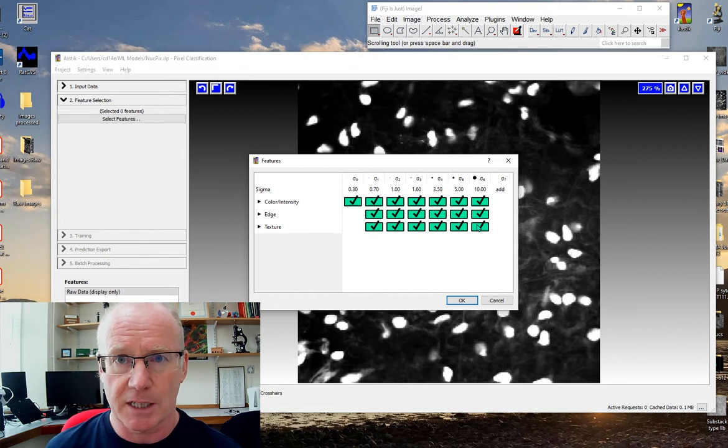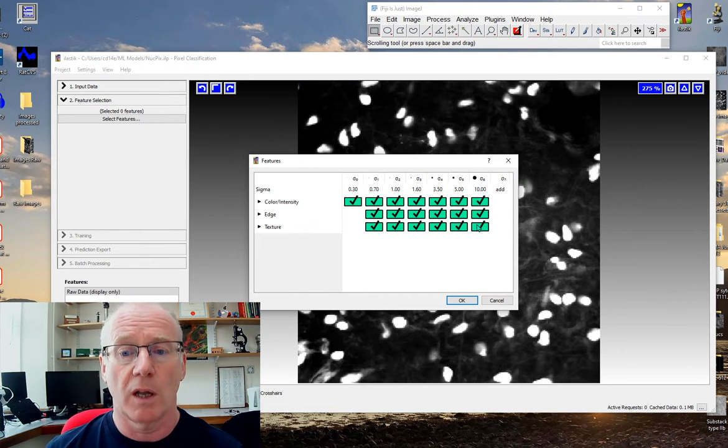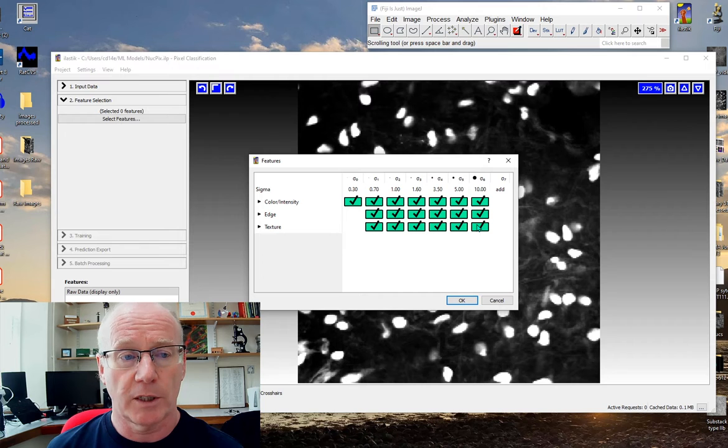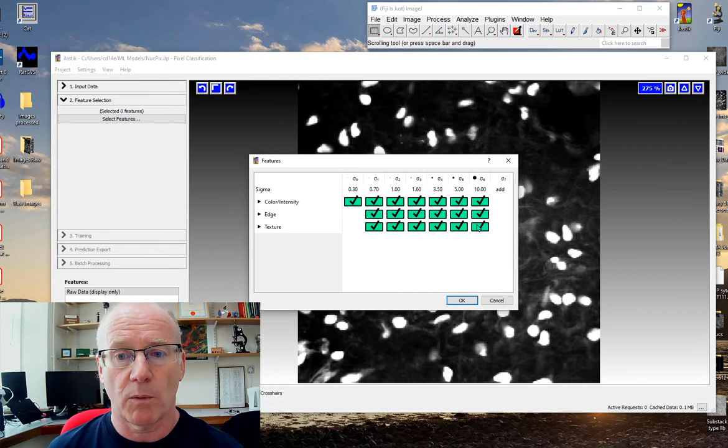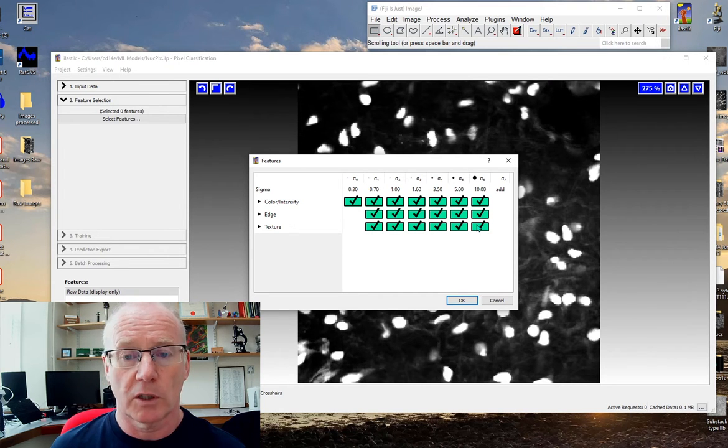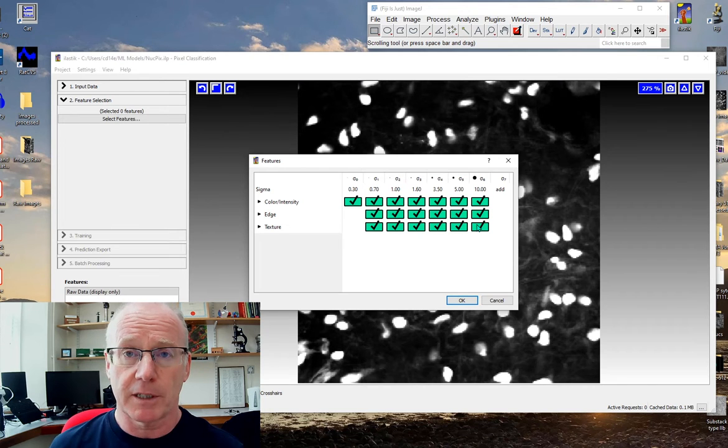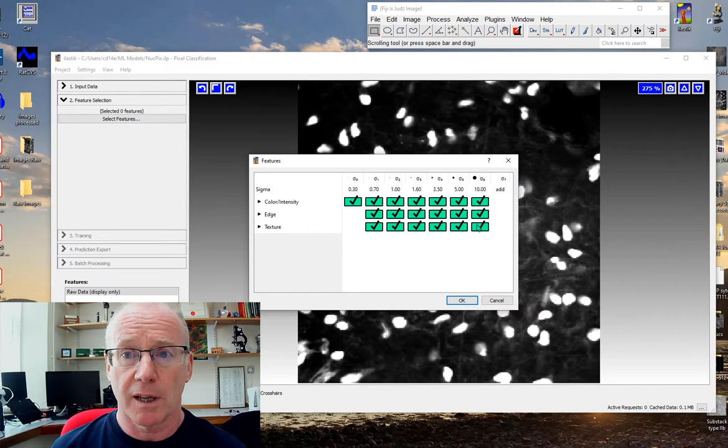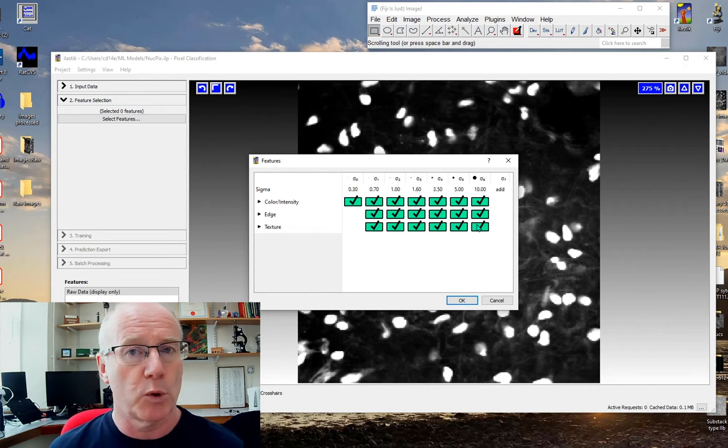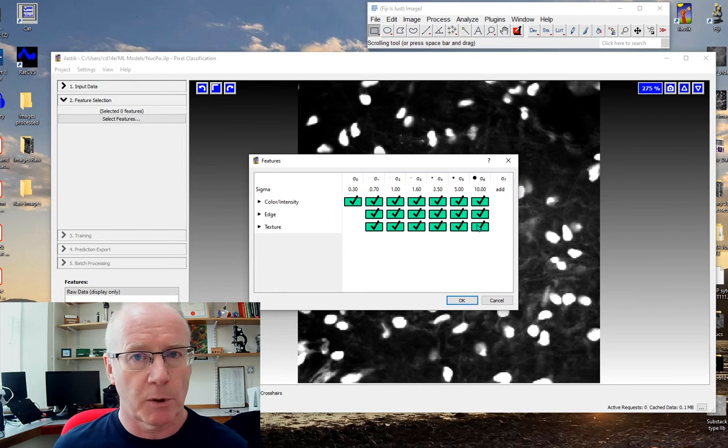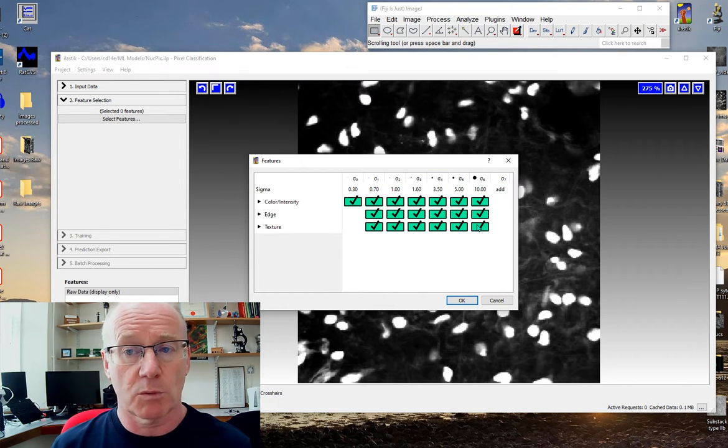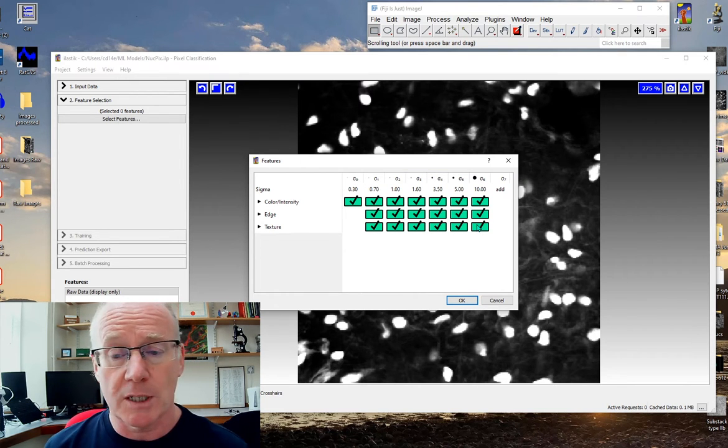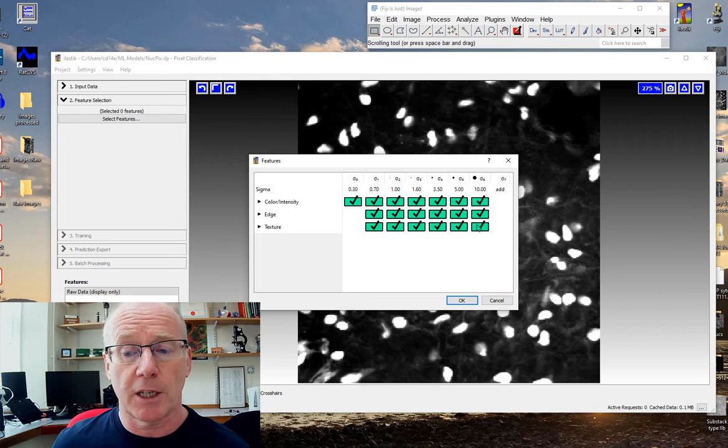Let's let Ilastik use everything it has to help us train our network. If we had lots of images then by selecting everything, every type of filter, it would be a large processing job. I'm not fussed about that because I have a relatively small number of images for this particular application.